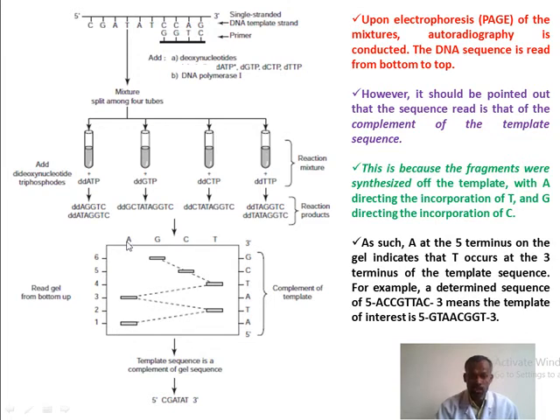So this is the adenine well, guanine well, cytosine well, and thymine well. We add the reaction, and after that it makes different bands. We know that the smaller DNA runs faster than the bigger one. Now we have to find out the sequence, since DNA replication starts from 5 prime to 3 prime.